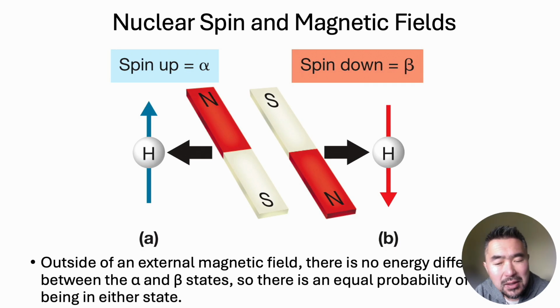It does something to the spin state of the nuclear particles like protons, because each subatomic particle is always spinning. When it's spinning and it's charged, it has its own electrical current essentially, and so it creates its own magnetic field. So if you apply a really strong external magnetic field, those two are going to interact, and that's the idea. And then you could flip it to the higher energy spin state, and when it relaxes you can get some signal from that.